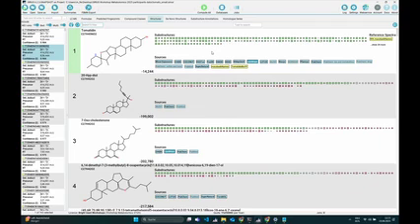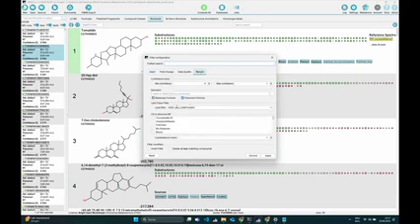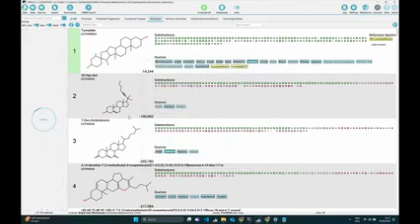Yeah, so in general, the CSI FingerID idea is not the best idea for annotating lipids. What we have done, at least, which we have not covered in the workshop, is a tool called ElGordo. Wait, I will just filter and look if something comes out. I want to filter by lipid class. Where is it? Here. Yeah, it might take a while.